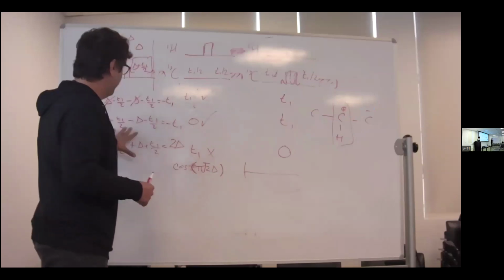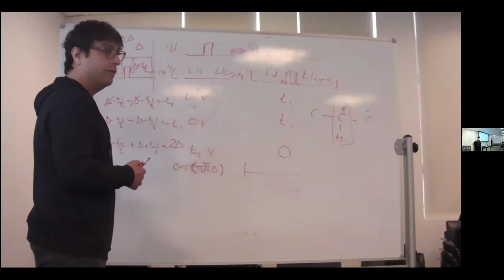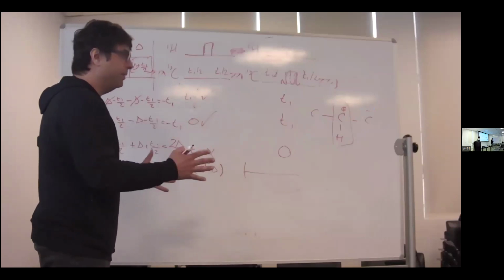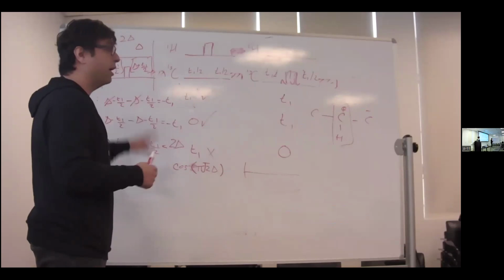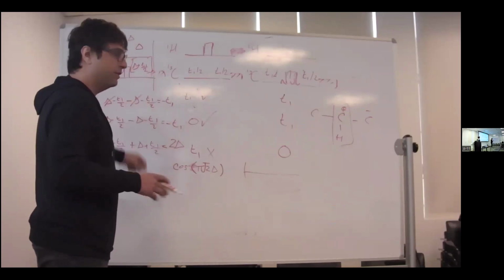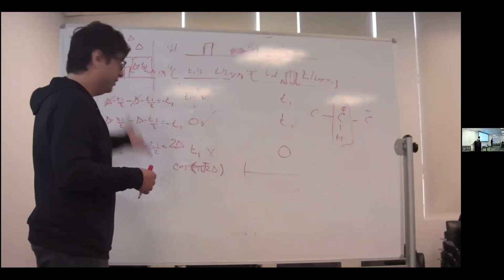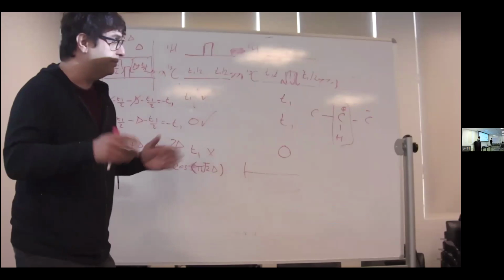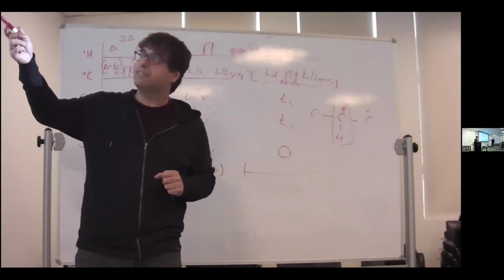So the constant time experiment is another widely used element in many of the pulse sequences that we use to measure, especially carbon, especially when we want to get rid of carbon-carbon couplings. It's a common use, again, it depends on our trade-offs. Because as I said, there's a lot of relaxation during that period. Now, this amazing sequence.